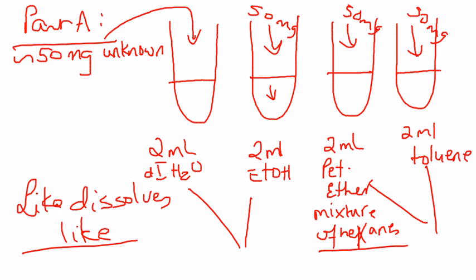It's a good idea to reverse the sequence basically, so that when you're doing the addition of the solvent, you do that along the walls if required. If there was anything stuck on the walls, everything is washed to the bottom of the test tube.